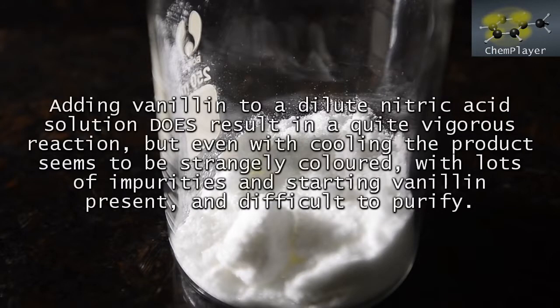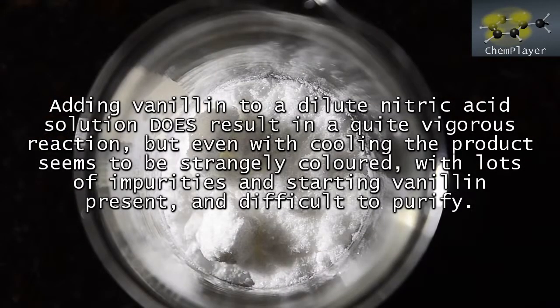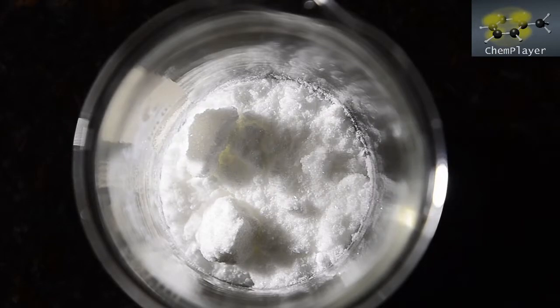We did try mixing vanillin with some fairly dilute nitric acid, but the resulting reaction seemed very vigorous indeed. We were also not sure if the vanillin reacted completely as it's insoluble in water. So let's try something different.